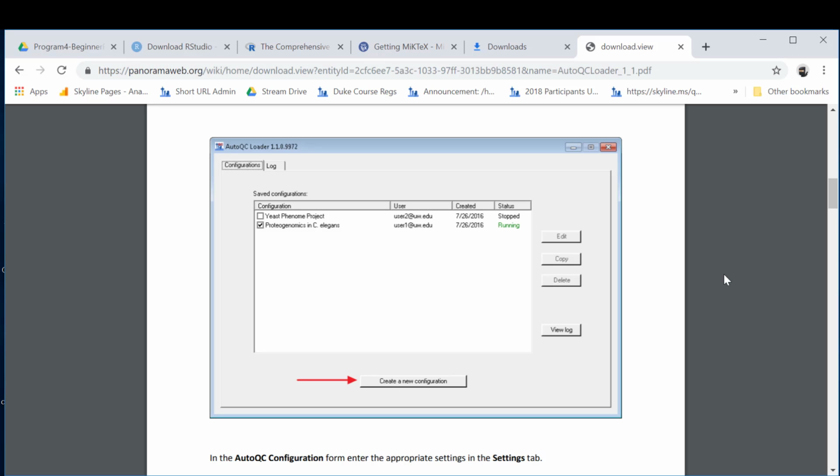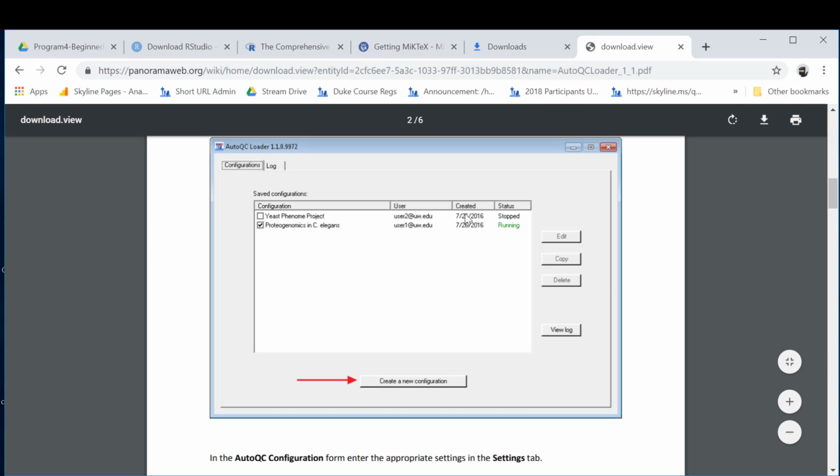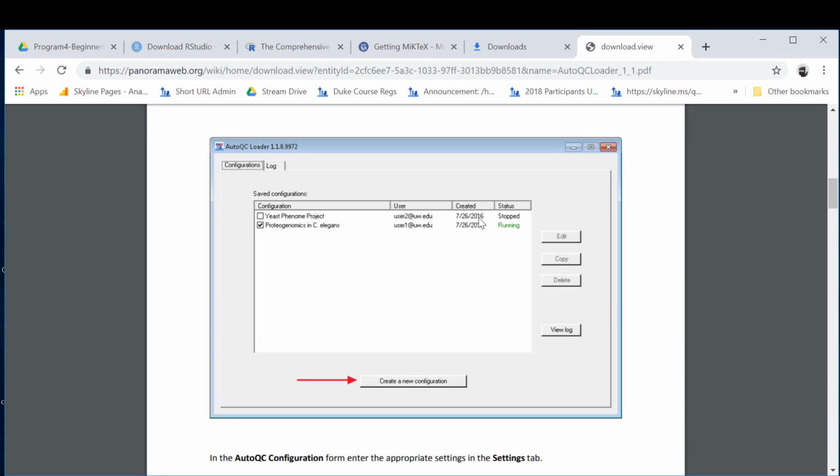We are currently working on everyone doing the same file organization, but we have, for example, Lindsay, Brian, Mike, Sandy, and when I log in, all I do is check my profile, and then that's it. I open up, I get my column equilibrating, I check my profile in AutoQC Loader, and then I just do everything like I would normally do.